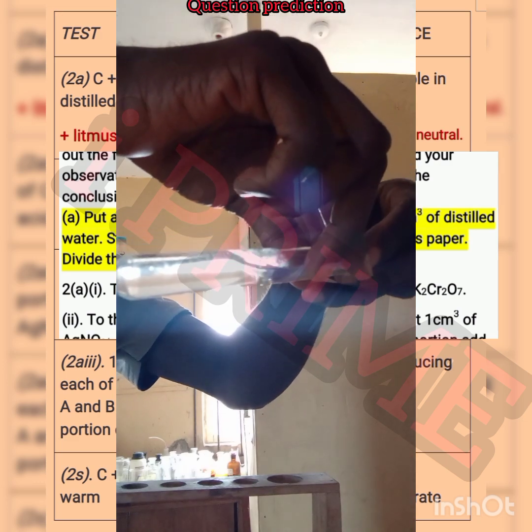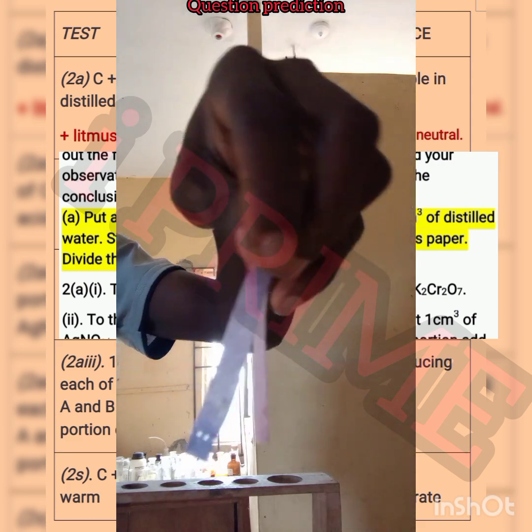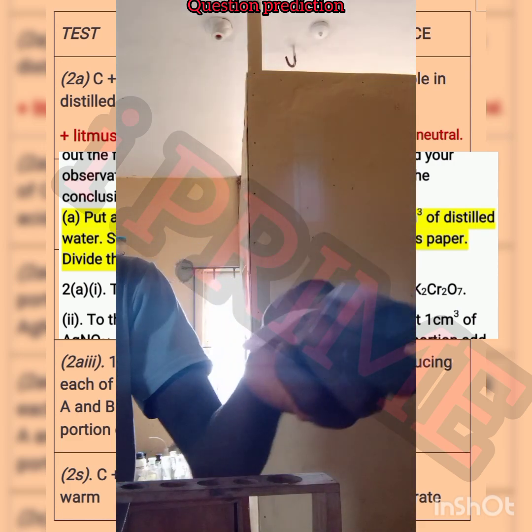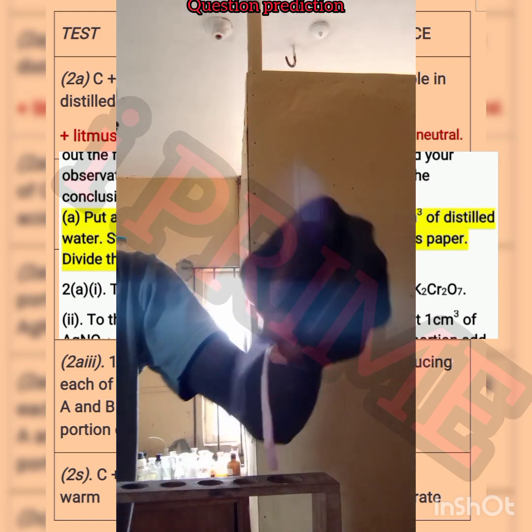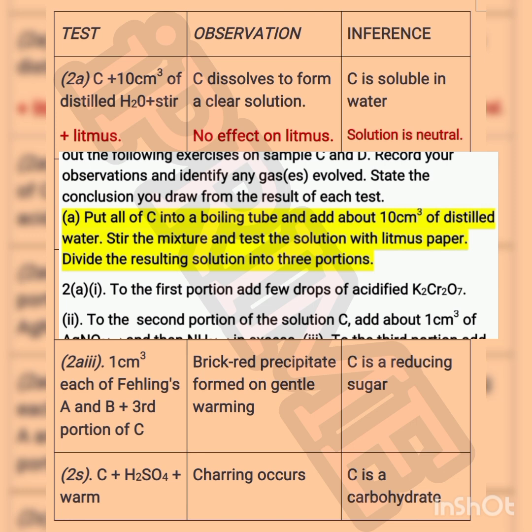The first thing you have to do, just from the test I've made here, is C plus 10 cm cube of distilled water, then plus stir. You have an observation.